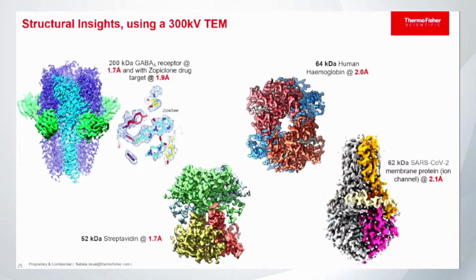You can change that very quickly in all the transmission electron microscopes we have. It's very easy to go from low magnification, call it the atlas, to medium magnification to high magnification. The higher the magnification, the smaller the pixel size will be on your camera, and that means the higher resolution you will be able to get. Obviously, if you go very crazy with the magnification, you will have a very small number of particles per image. So you need a balance where you still have enough particles per image, but the pixel size is small enough that you can get a high resolution.